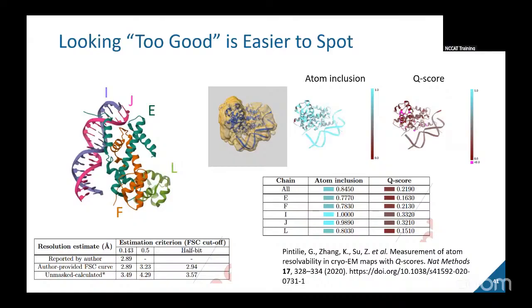And then when you go to the validation report, it's in a CIF file, or mmCIF, so you can look at it in a variety of ways. Typically, when we discuss ligand Q-scores, you can have an average for a full structure, an average for a residue, or you can get really down into looking at even the atoms in a side chain, each of them. So I think it's striving to answer a similar question about how much it approximates the density. Yes? Is the Q-score impacted by deleting residues?